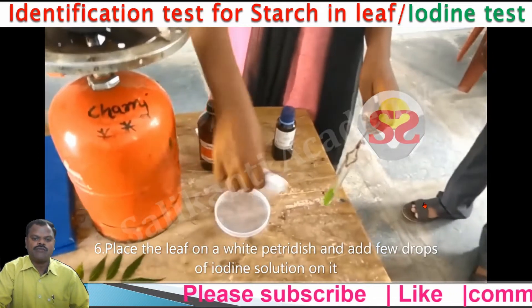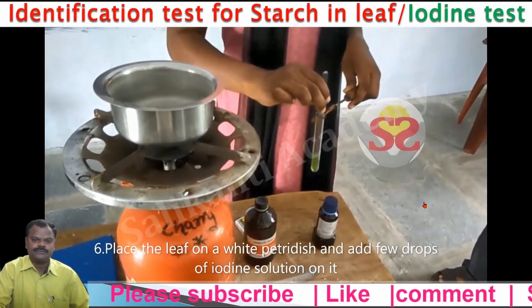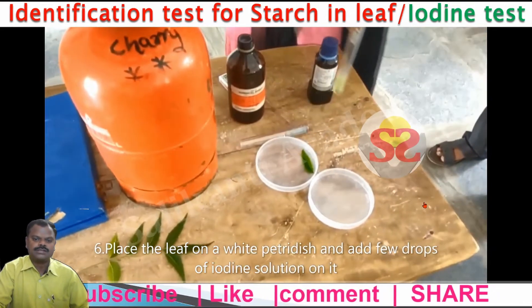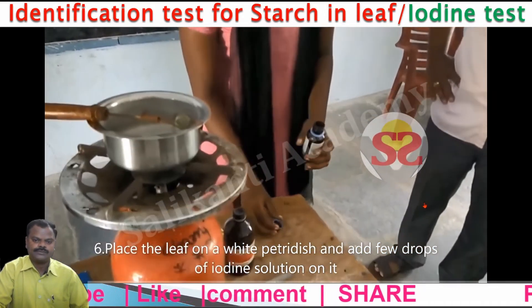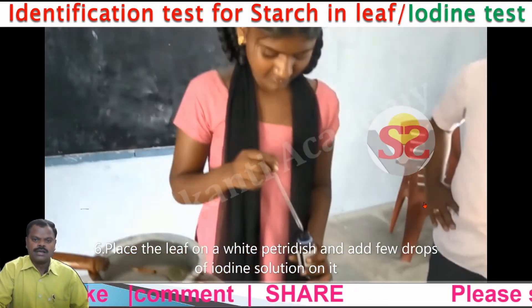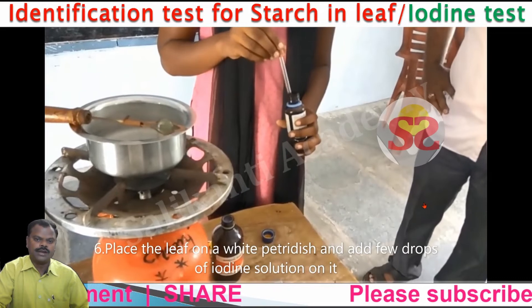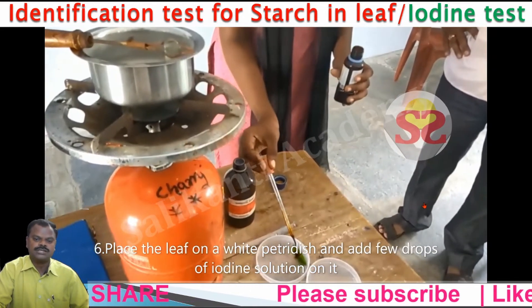Place the leaf on a white petri dish and add a few drops of iodine solution on it. By adding iodine solution, the pale leaf part changes into blue-black color. Some parts change into blue-black color because starch, by reacting with iodine solution, changes its color.